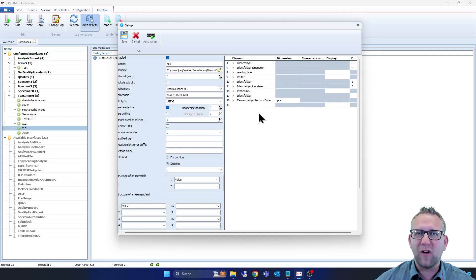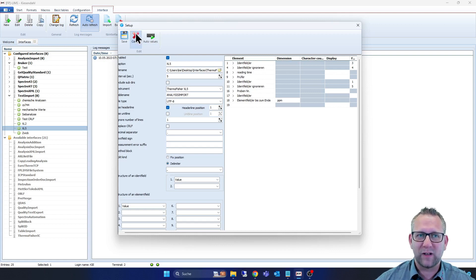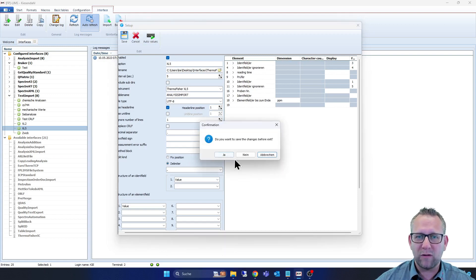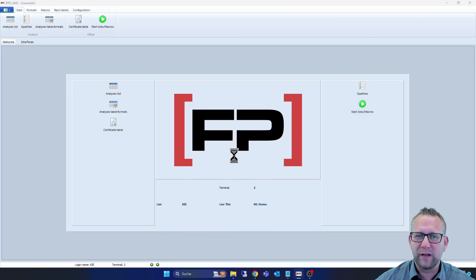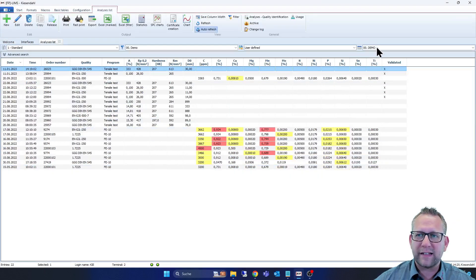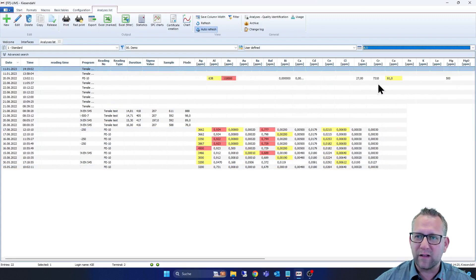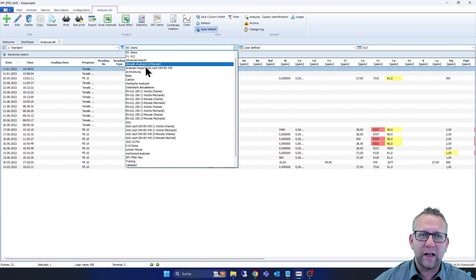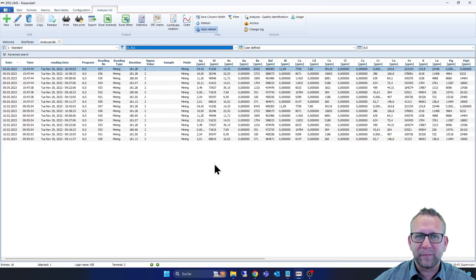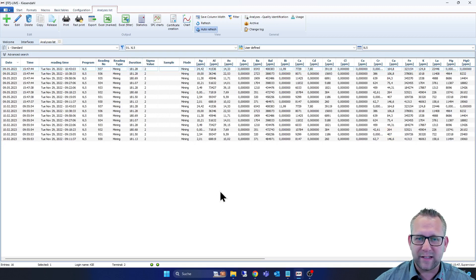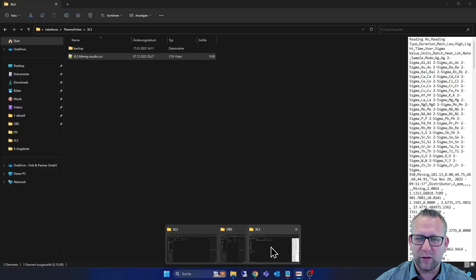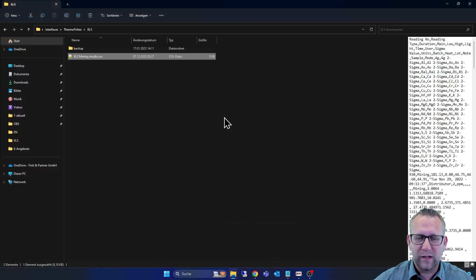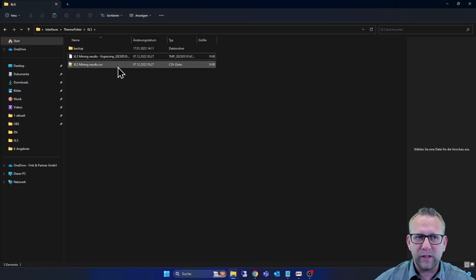So now I want to show you how easy it works. We go now back at the welcome window into the Analyzers, select here the view of the XL5 and the filter.